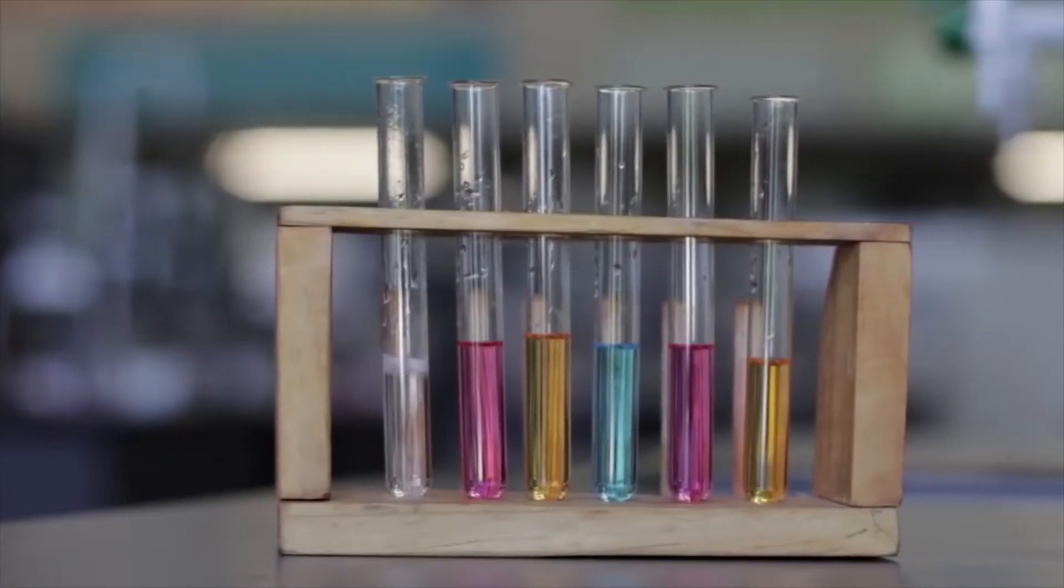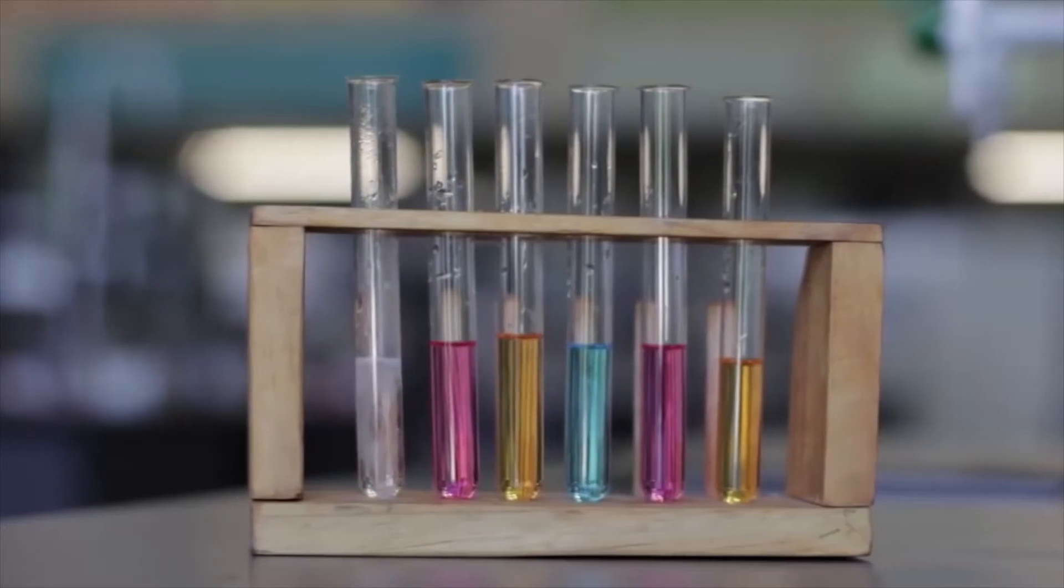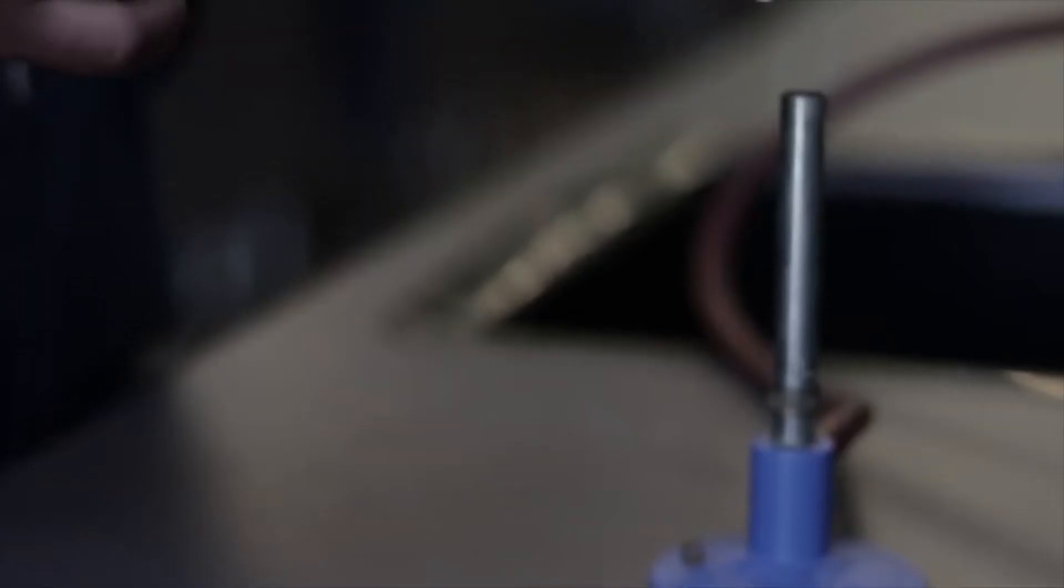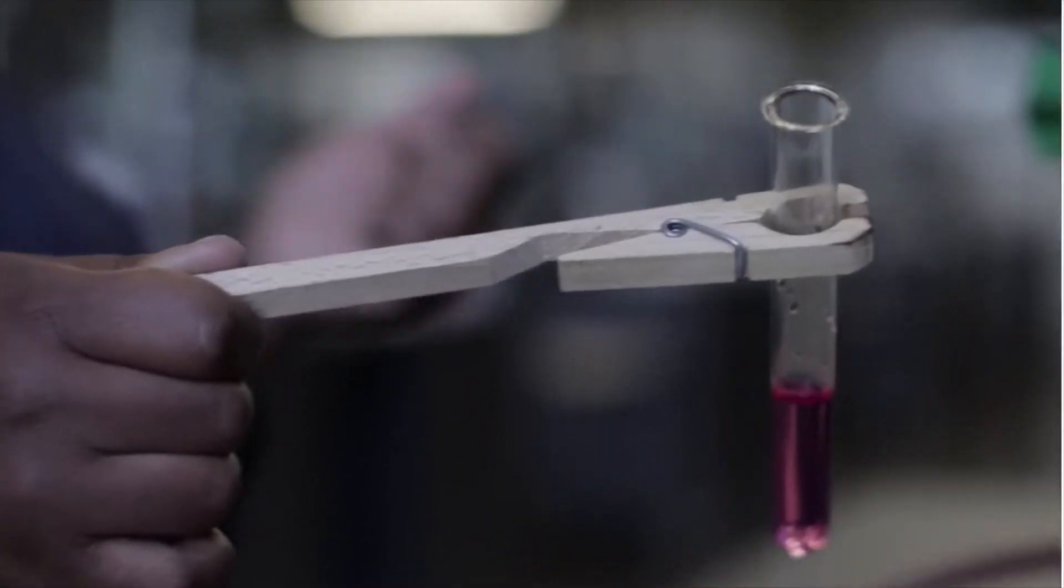Long U-shaped glassware that is open at the top and closed at the bottom. Test tubes are used for qualitative experiments. They are used to mix, hold and heat solutions and then observe the changes.